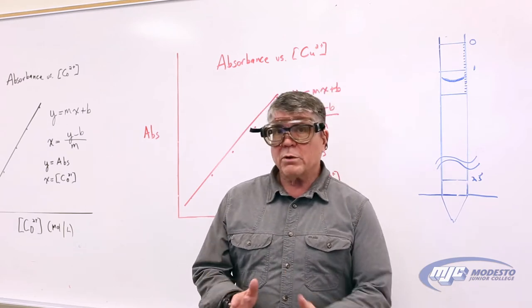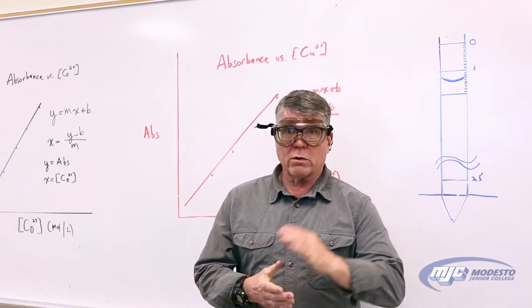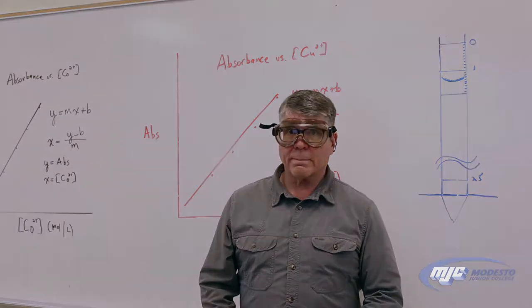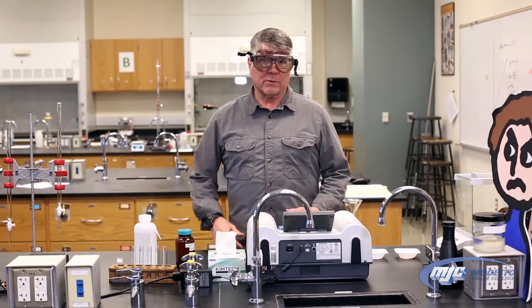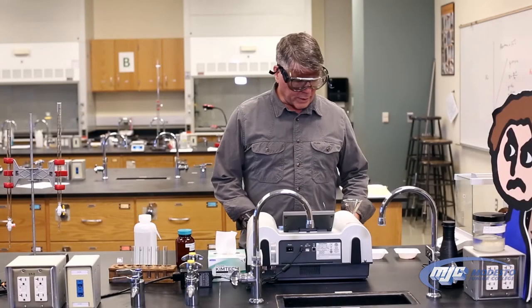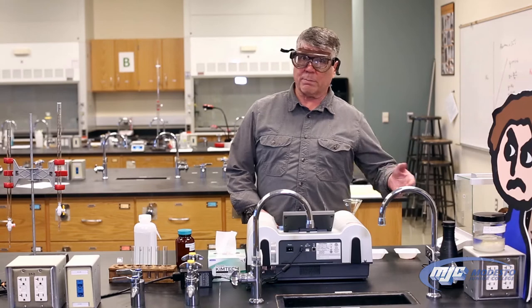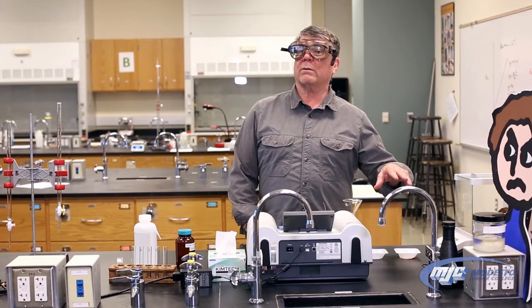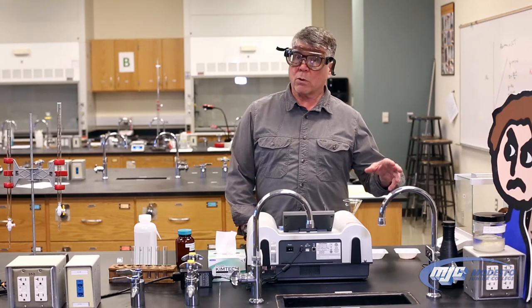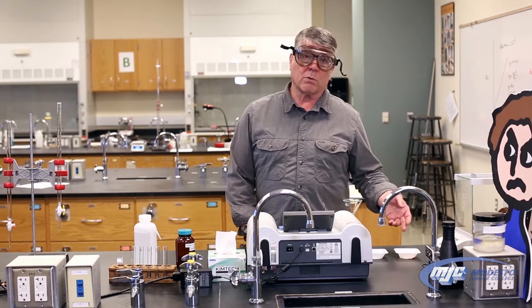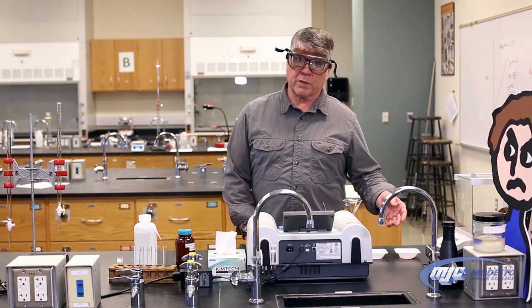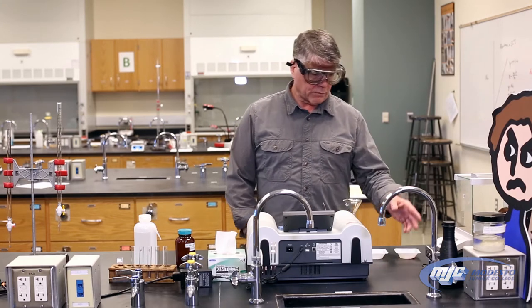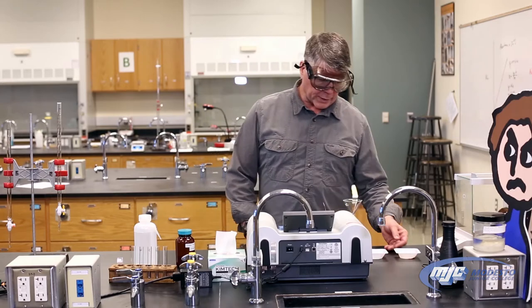That's pretty much what we're going to do — let's go on over there and start the experiment. The first thing we need to do is make up our stock solution. Remember, you figured out already about how many grams of cobalt nitrate hexahydrate you need and of the copper sulfate pentahydrate, so I've weighed those out already.